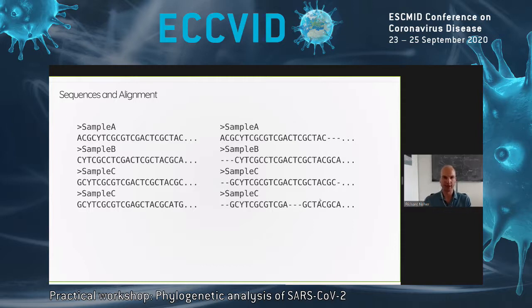and that you can meaningfully look at the changes in these data. Luckily, there's a large suite of third-party programs out there that do this for you. One of them is called MAFFT, there's ClustalW, there's MUSCLE. These programs and alignment algorithms are also integrated in more point-and-click editing genomics applications like Geneious and so forth. So this typically isn't a big obstacle, but it's something that needs to be done before you actually start using these data.